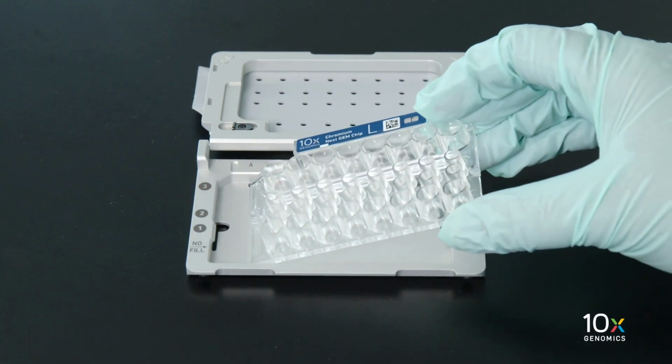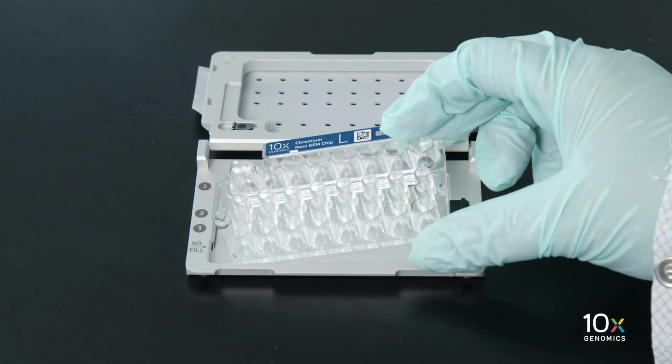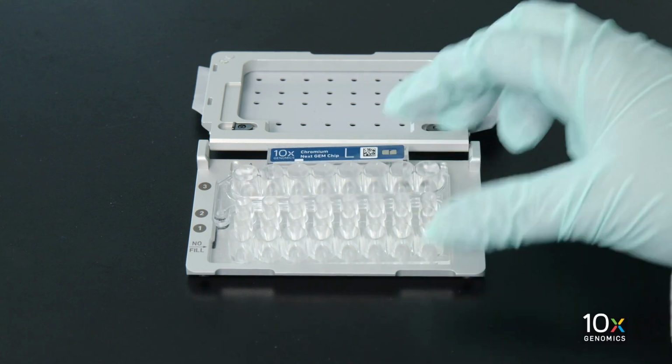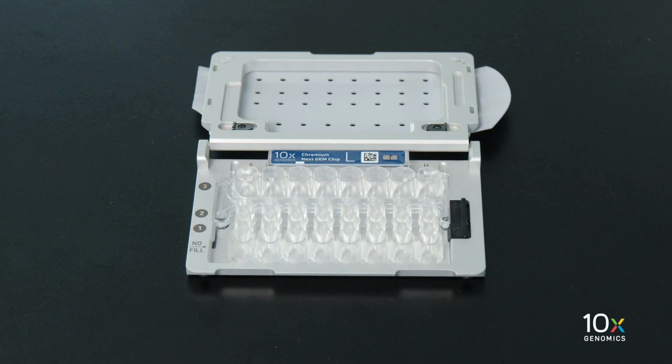Align the notch on the chip in the upper left corner and the holder. Slide the chip to the left until the chip is inserted under the guide on the holder. Depress the right-hand side of the chip until the spring-loaded clip engages. We are ready to load reagents into the wells.